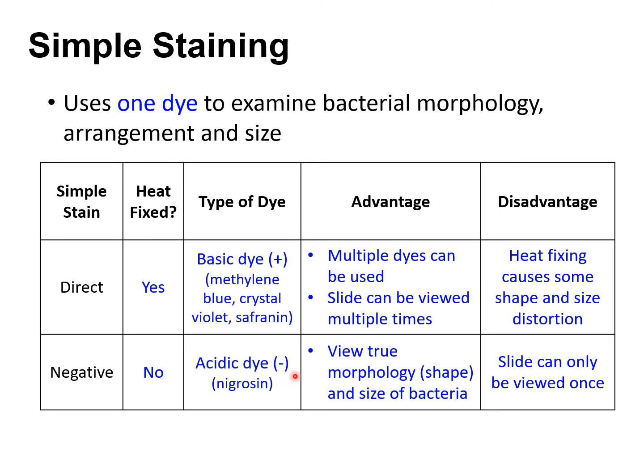A disadvantage is that because you didn't heat fix, you can't really store your slide, because eventually the bacteria can come off of the slide, so you can't store it and view it several times. Usually we view it just once and that's it. You would have to discard your slide.